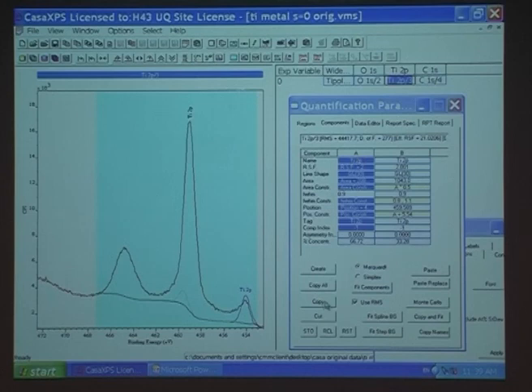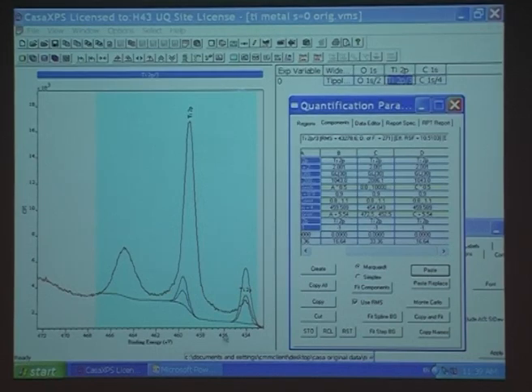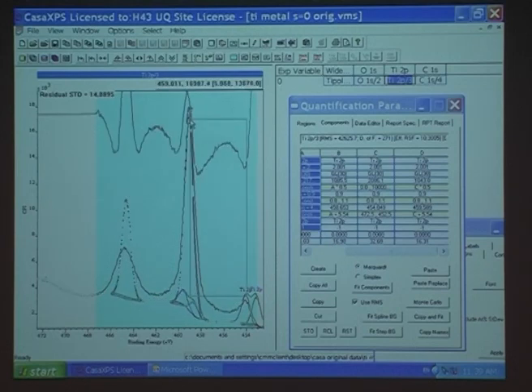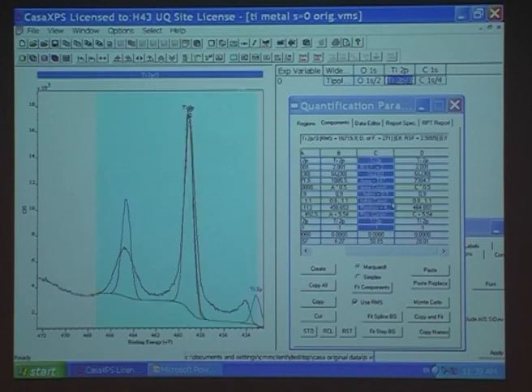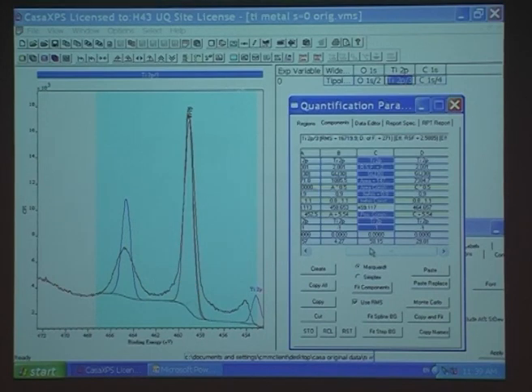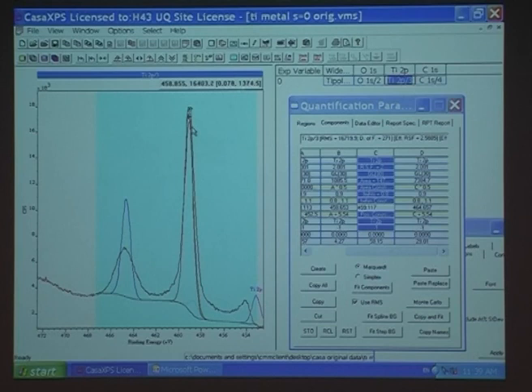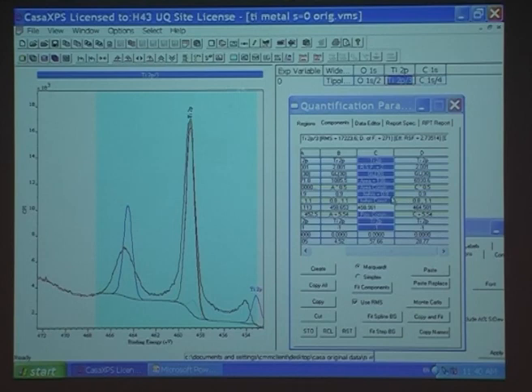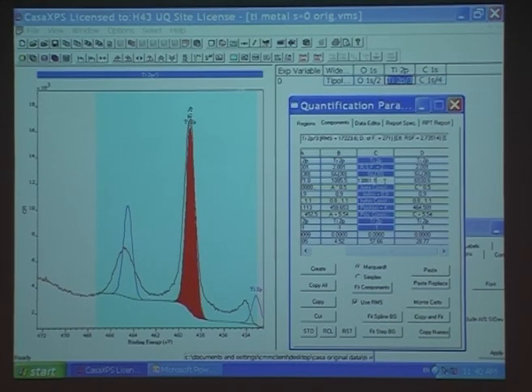So then I can go copy and paste. I move this one to the side and I'm going to bring the next one into here. I'll bring this one up into here. And you can see that this is going to be much, much wider. So I'm going to come up into here and give this a width of something like 1.8. Bring it into here. It's going to be even wider. So I come up here. Now this one, didn't I change it to 1? I didn't push enter. I'll make it 2. Enter. Oops, input error. What was I doing?